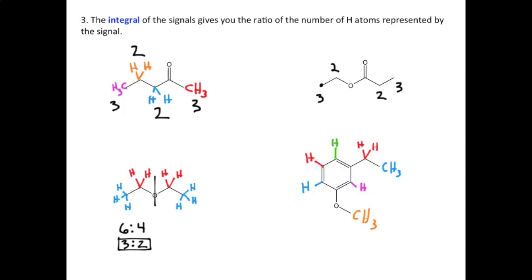But, as we mentioned before, often the hydrogens of the aromatic rings overlap. So many times it's hard to tell which peak belongs to which hydrogen. And guess what? That's fine. Because these hydrogens all will come between 6.5 and 8, the hydrogens in black, we can just integrate and lump them all together.